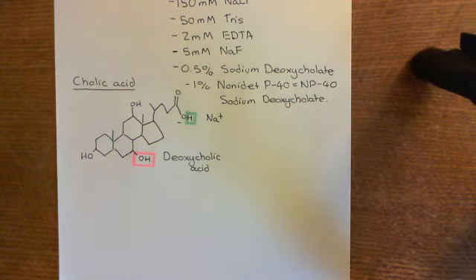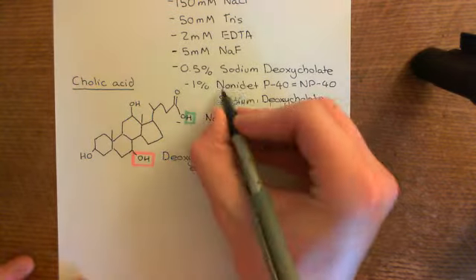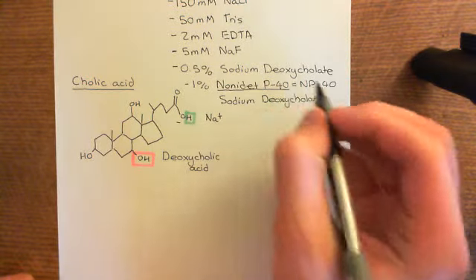So basically, Nonidet P40 is going to have a very long hydrophobic portion, but it's also going to have a terminal polar group. So that's why it's going to be a detergent, because it will have a polar group which can interact with water, and then hydrophobic groups which will interact very well with fats. Okay, so let me now show you the structure of Nonidet P40.